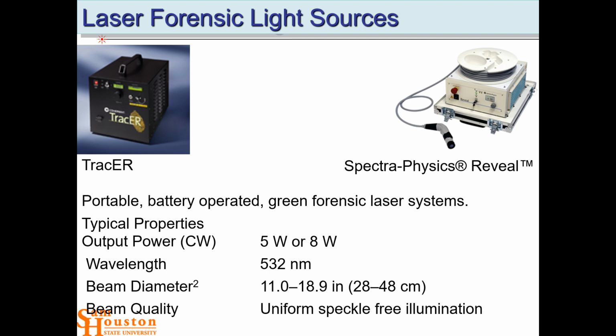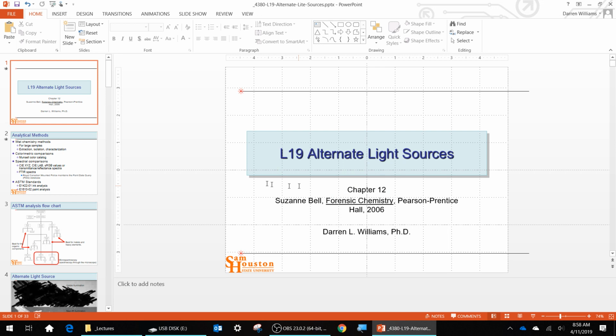Fiber optics are fairly sensitive. We don't kink them because the light's bouncing inside the fiber optic, so it has to have somewhat of a gradual curvature. If you kink it 90 degrees and break the glass, then the laser light will leak out wherever there's a break, and it won't be transmitted to the end. So that's all I have for that. We can build that same.